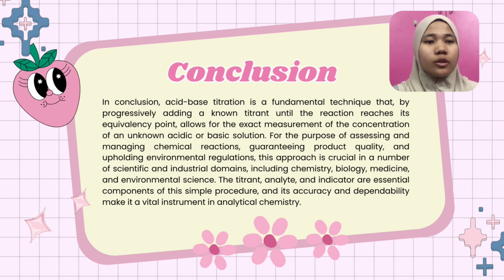This approach is crucial in a number of scientific and industrial domains, including chemistry, biology, medicine, and environmental science. The titrant, analyte, and indicator are essential components of this simple procedure, and its accuracy and dependability make it a vital instrument in analytical chemistry.